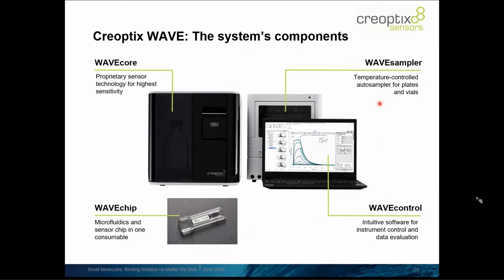Then there's of course a WAVE sampler, that's the auto sampler. It houses two plates, so it has two positions that you can equip either with 96-well or 384-well plates, or also racks for putting in vials for bigger volumes.